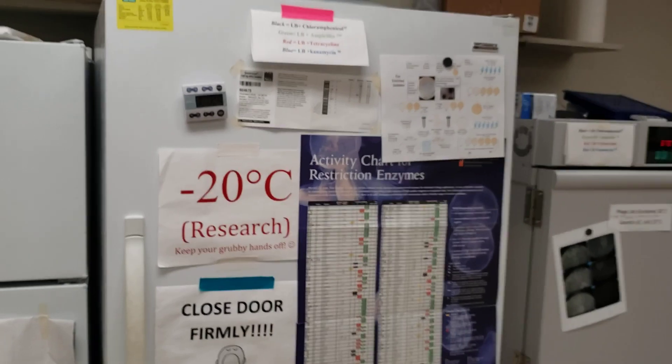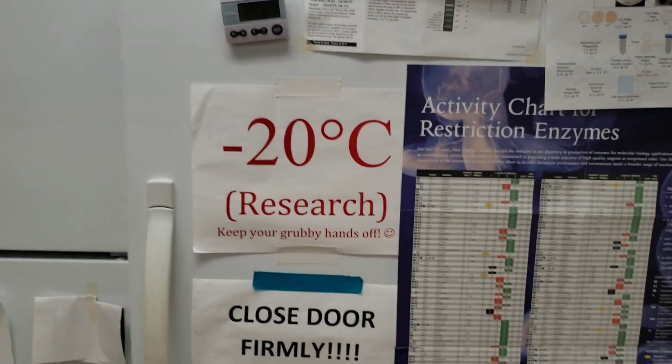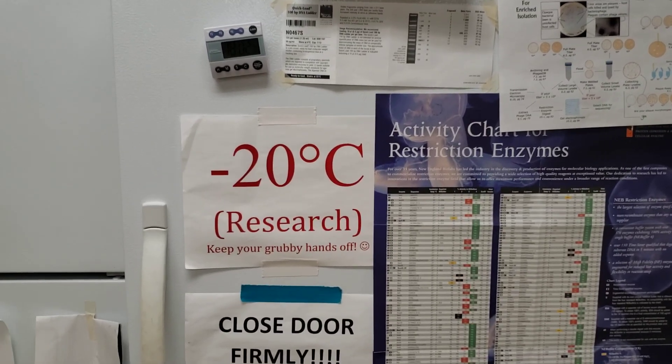I also have a research minus-20 freezer and students are told to keep their hands off and stay away from it. This is where I keep our bulk material, and if we need something I go and get it.